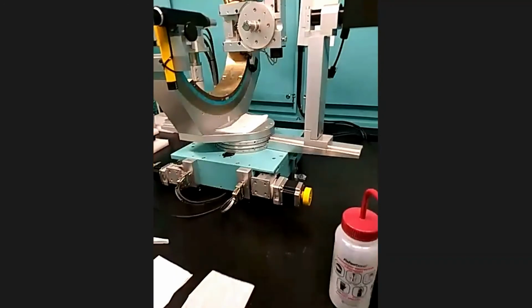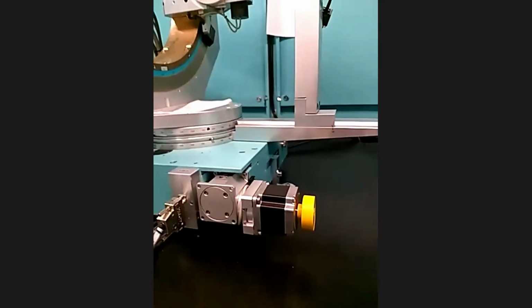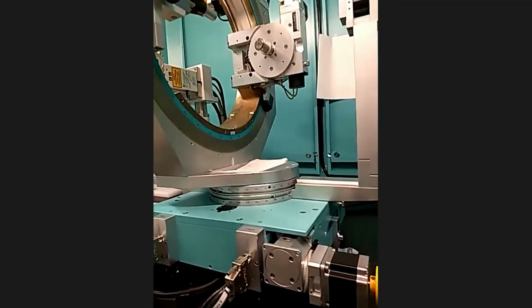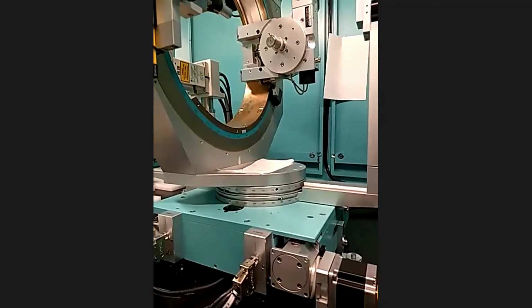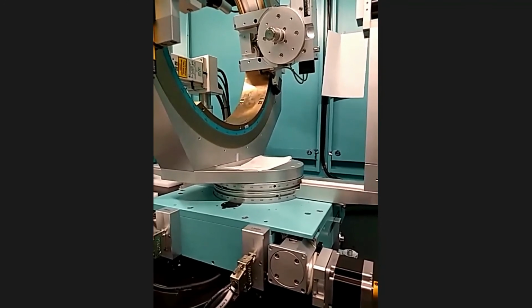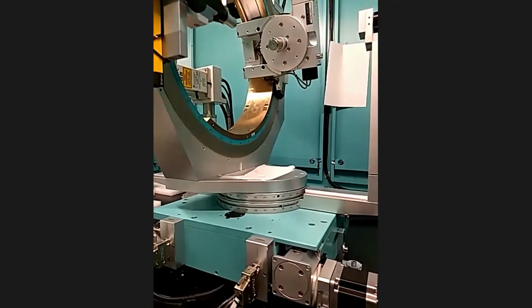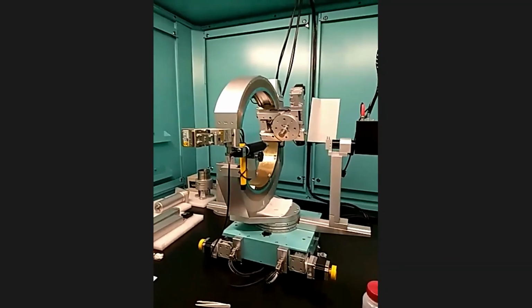It's extremely accurate in moving. That's the one thing we need from this motion. It's like 0.001 degrees it can take. So that's a whole lot of accuracy when you are trying to figure out some complicated structures.